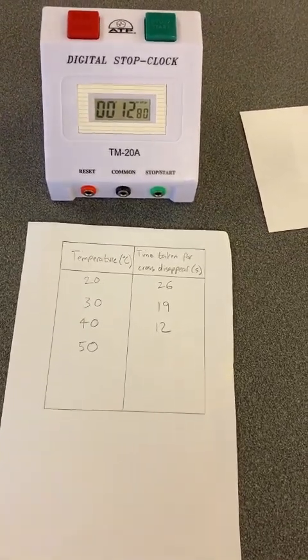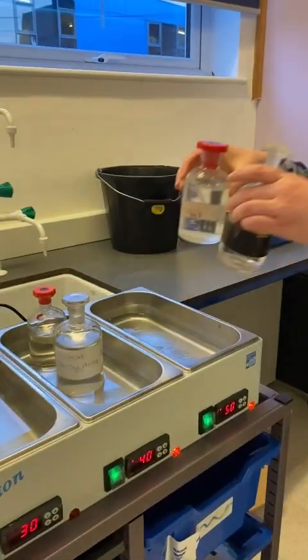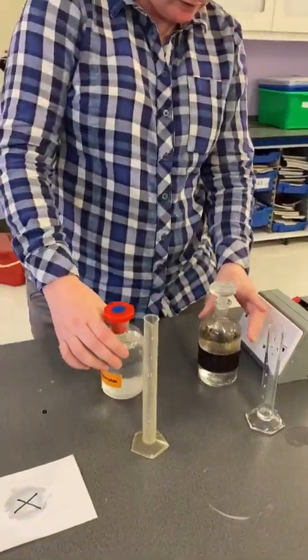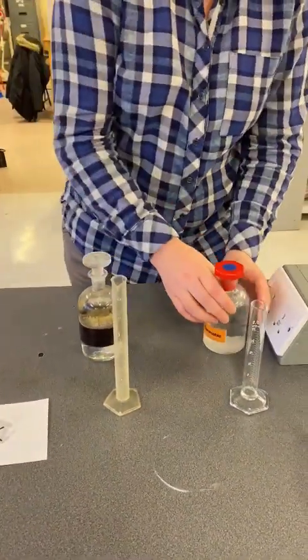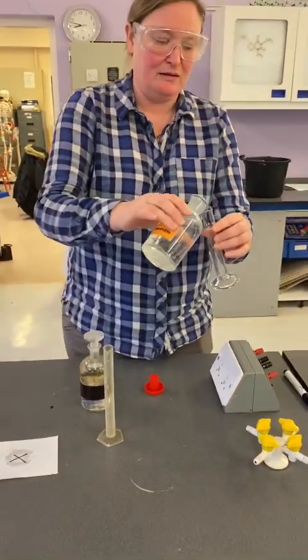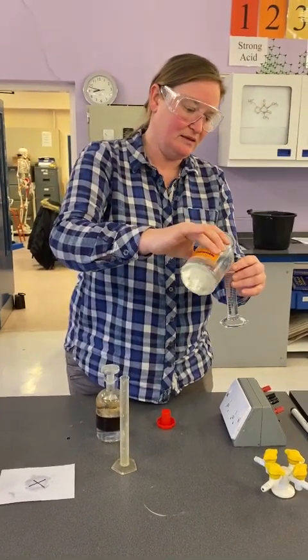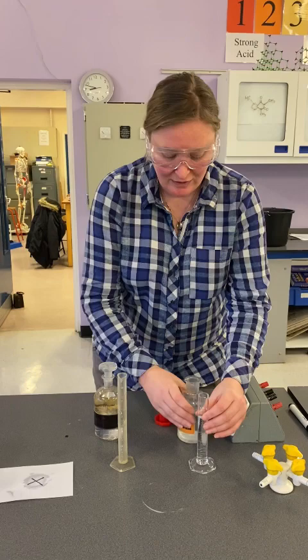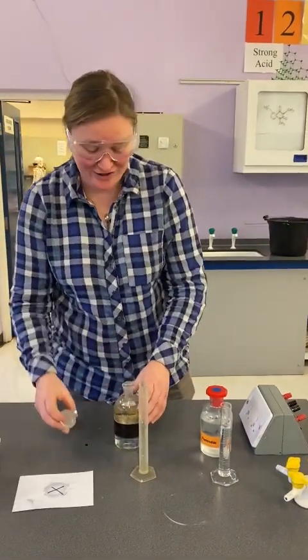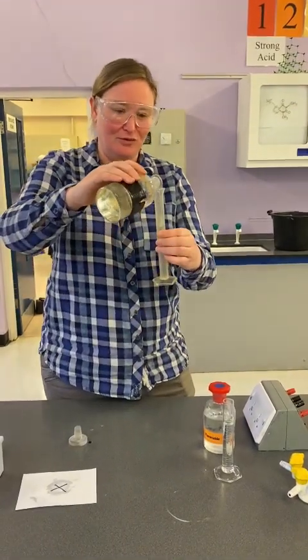Our final temperature, 50 degrees Celsius. Take our lovely warm sodium thiosulfate. Oh, make sure I don't get that round the wrong way. Which has now been warmed to a very warm 50 degrees Celsius. You're lucky you're doing this on video. In person, it smells like sulfur, which is a smell of rotten eggs. So we suffer for you.